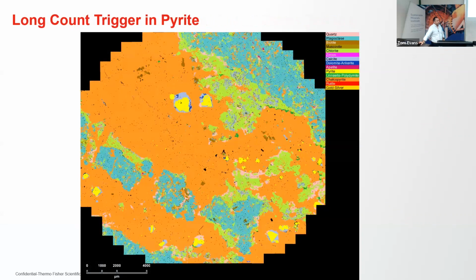Another topic, also from China in the critical minerals space, is cobalt. Of course, everybody's chasing cobalt, not only outside China, but inside China. And we found that this sample, everybody knew this sample contains some amount of cobalt, and some of that cobalt was in pyrite. So it could happen as an impurity, and the software will understand that. We can tell the software that.